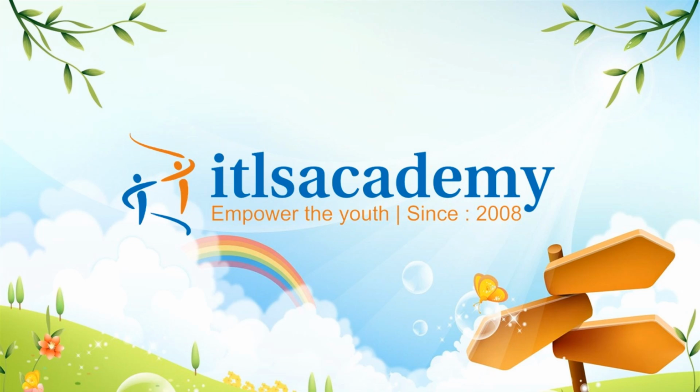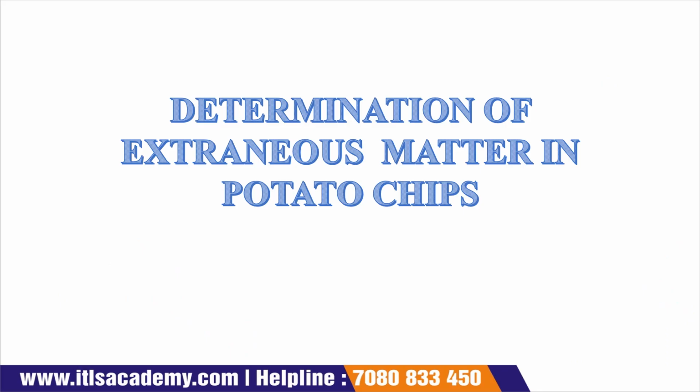Today we are going to discuss the topic of determination of extraneous matter in potato chips.